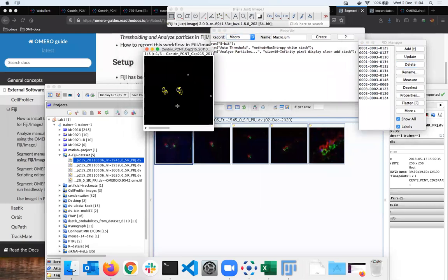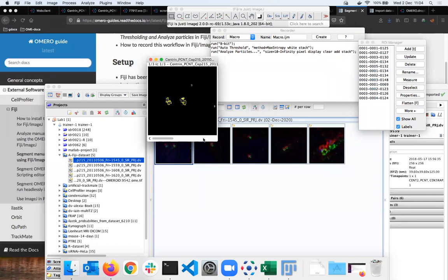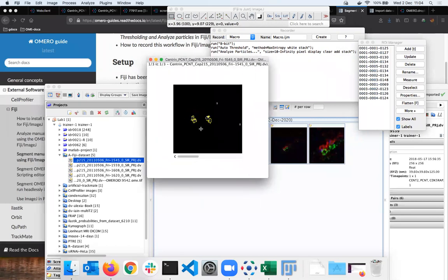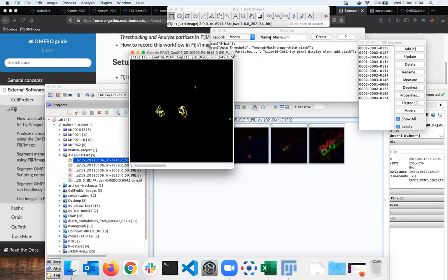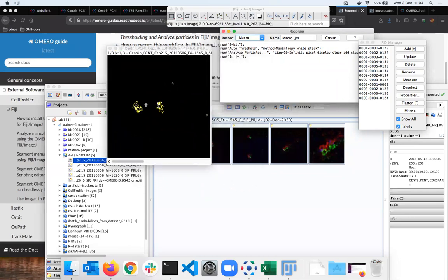And you can see that I have created some interesting regions of interest. In Fiji, they look already much better than the funny region I just drew by hand. And I have a 3-channel image. That's why you can see the slight mismatch, because the ROIs are in all 3 channels. And now I can simply go and save the ROIs in OMERO manually. That would be nice, but ultimately not that interesting, because you already saw how to save ROIs into OMERO manually.